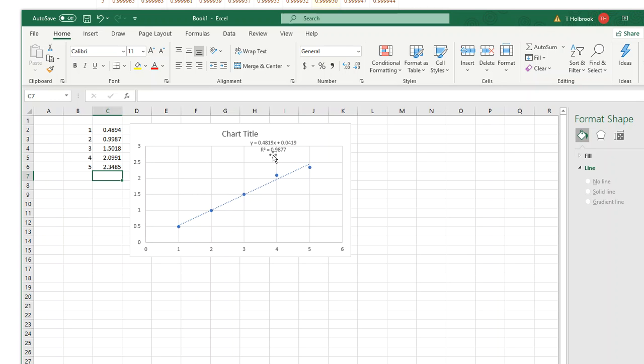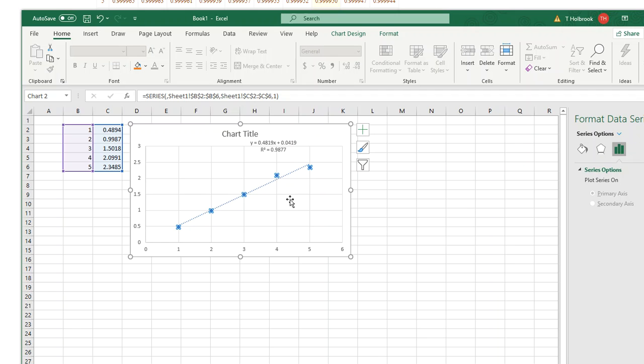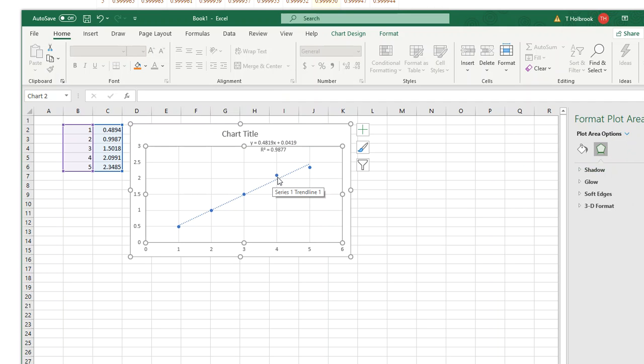My R squared value, 0.9877, is lower than 1. It's further away from it, which means it's not as good of a line as it could be. It's slightly imperfect, and we can actually visually see that. Look at the dotted line that it's drawn. This point is a little bit above that dotted line, which means that is my problem area. That means that maybe when I did this data measurement in a laboratory, something here went off. And that dot seems a little bit elevated, which means I could maybe go back and try this one again if I want better data.